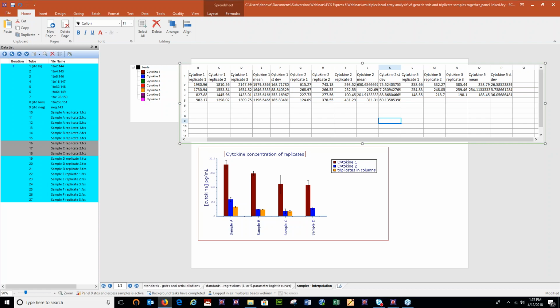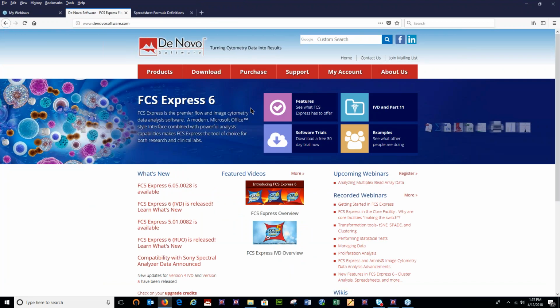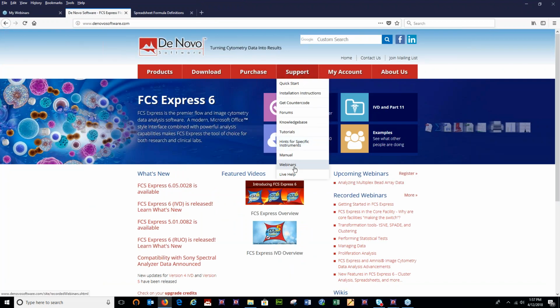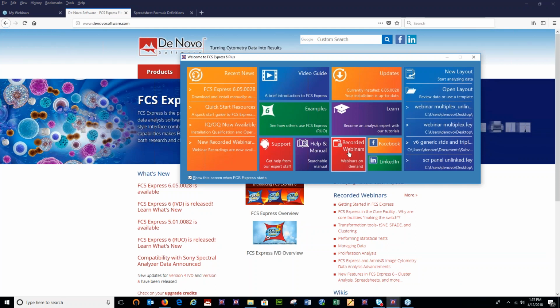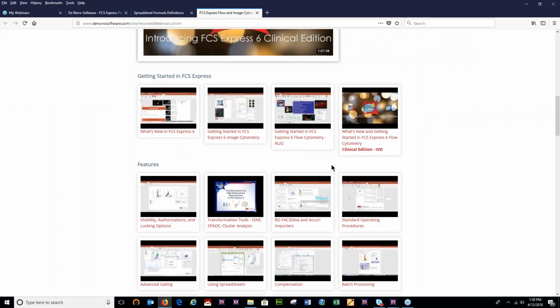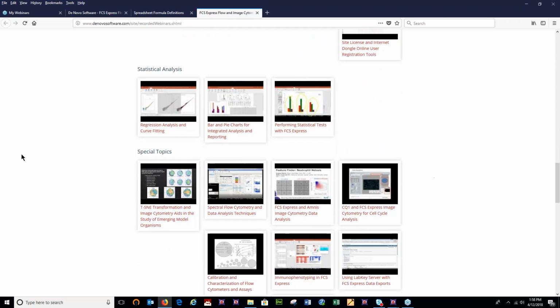And as promised, I want to show you the webinars page. If you were to just go to denovosoftware.com and click on webinars here under the support tab, or you can go to your startup screen and click on recorded webinars, it'll take you to the same place. We have a whole bunch of other webinars. There's one I want to point out to you, especially if you'd like to make bar plots with error bars and even asterisks showing the p-values from your t-tests for significance. We do have a webinar that will speak to you specifically about that. So if you watch this one here, that will take you through that kind of analysis.